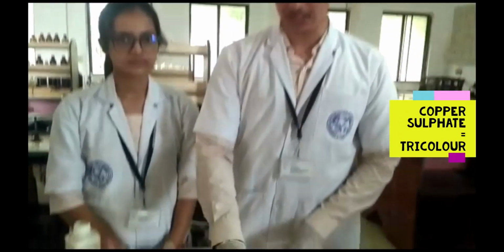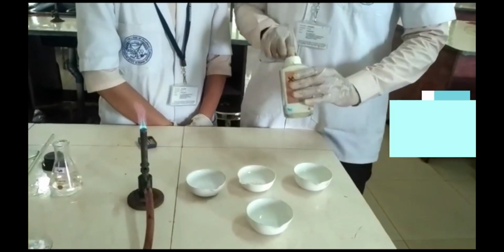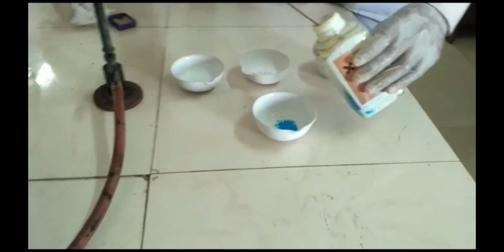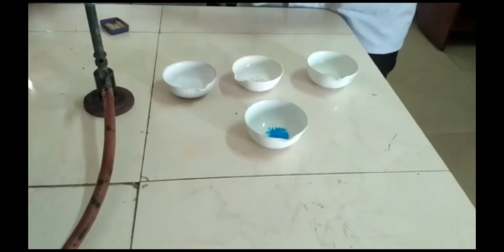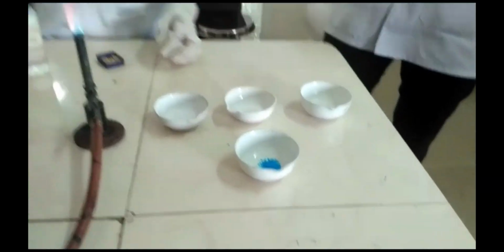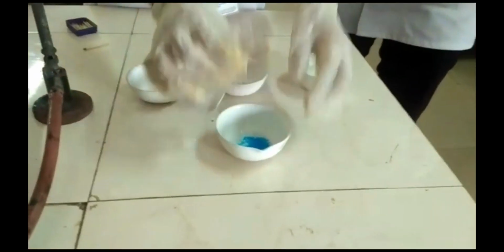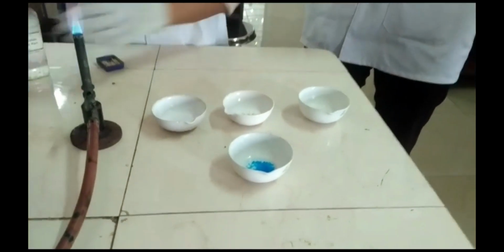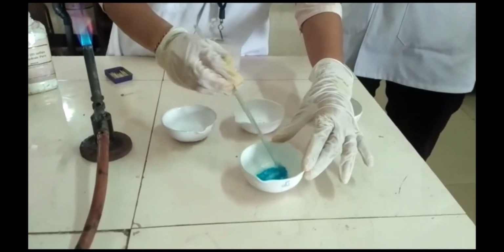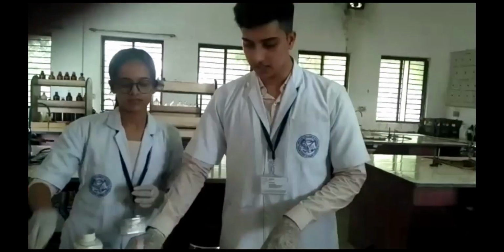Now we're going to take another china dish and we're going to add copper sulfate to it. Now I am going to add methanol to this and mix it a little bit. Now I'm going to light the china dish.